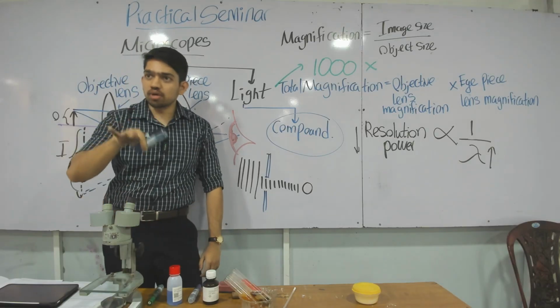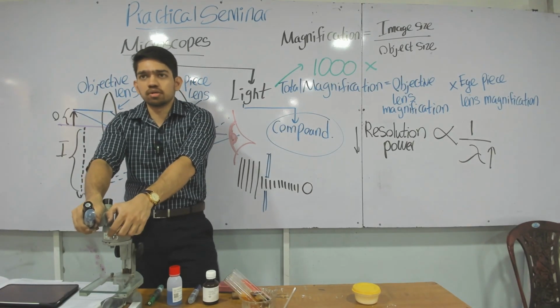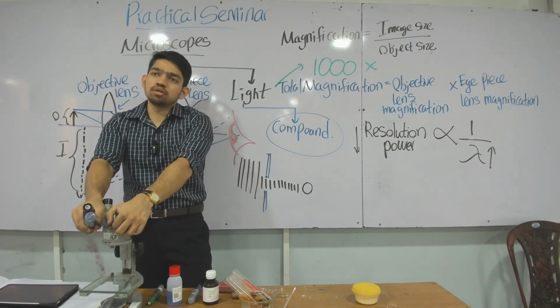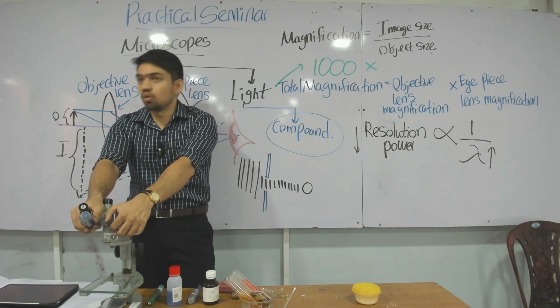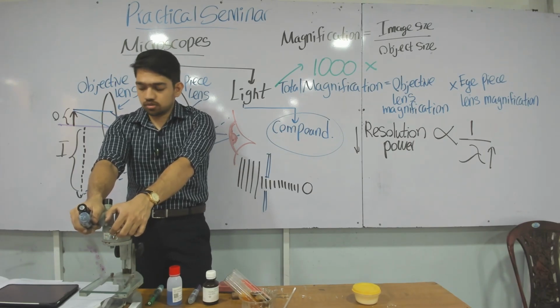The light microscope lets you see large bacteria, the nucleus, mitochondria. If you want to see beyond that, you needed a source of illumination with a lower wavelength than light. That's why you had to invent the electron microscope. Okay.